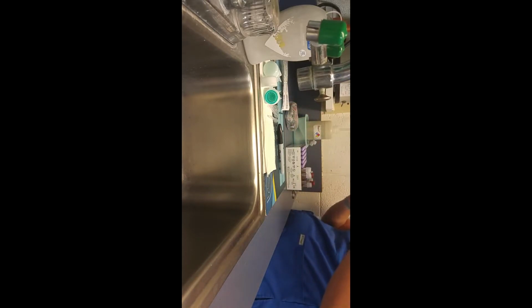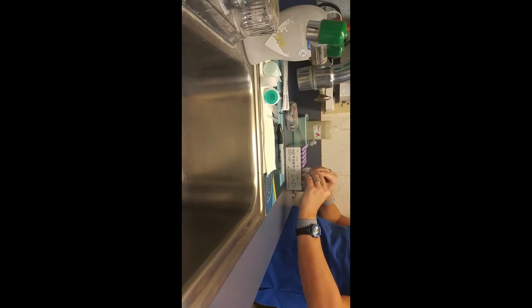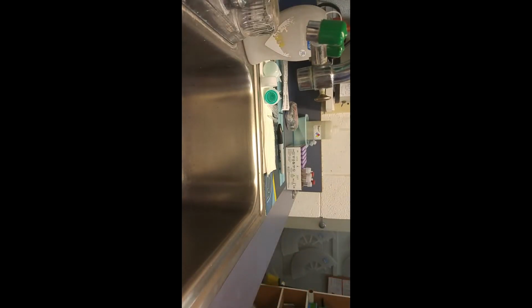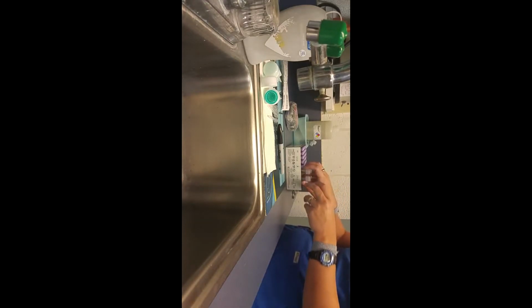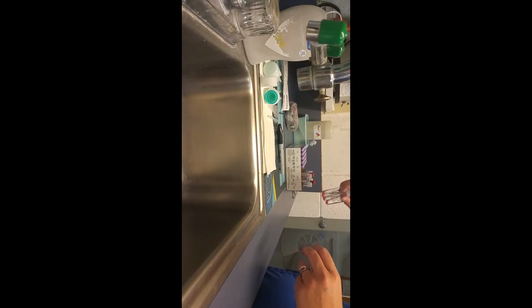Okay, so I've got my controls here next to each other, and then I've also got my actual testing tubes over here. At this point, I'm going to take all of the tubes. I'm going to gently shake them just to mix them a little bit. And then I'm going to let them sit here at room temperature.